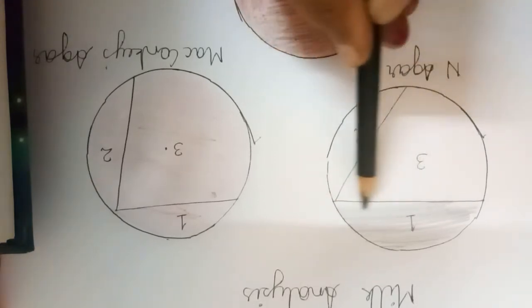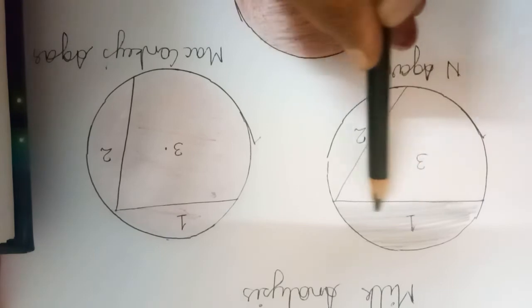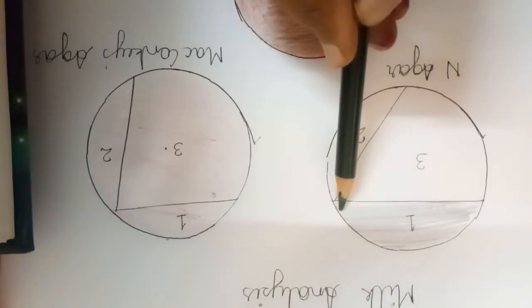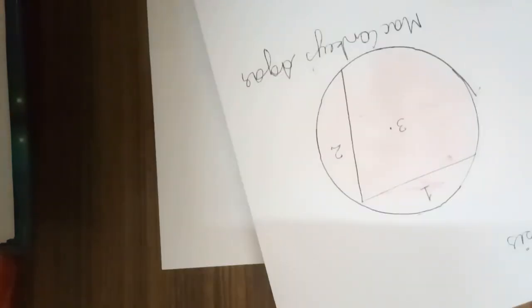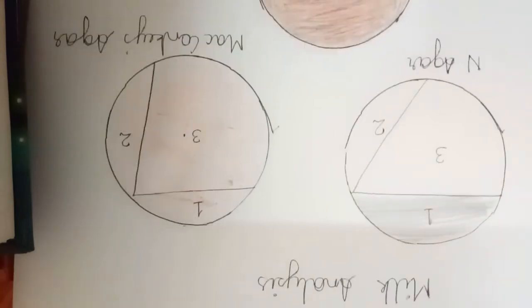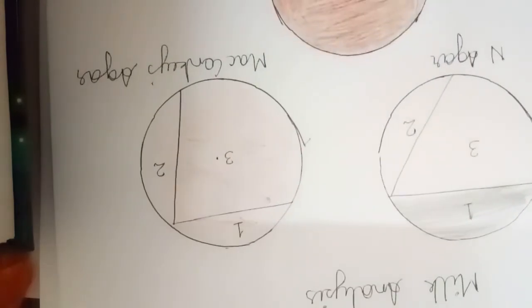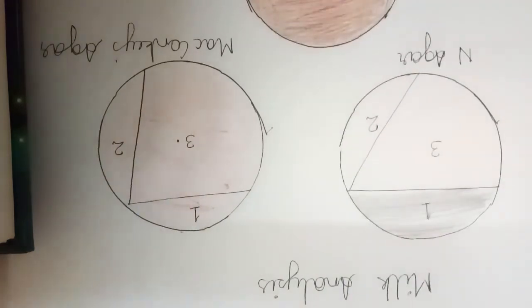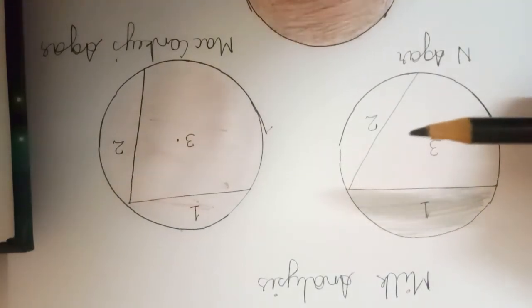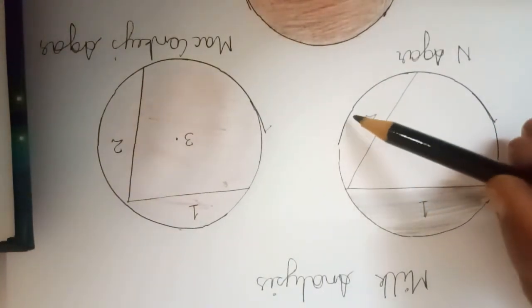Okay, so we have completed streaking the first sector. Now we will go for another sector, sector number 2. So for that we will make the change, and we will move the loop, or you can also move the plate, and now we are going to inoculate the sector number 2.